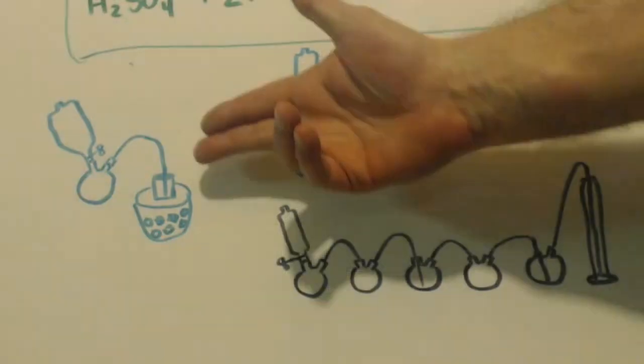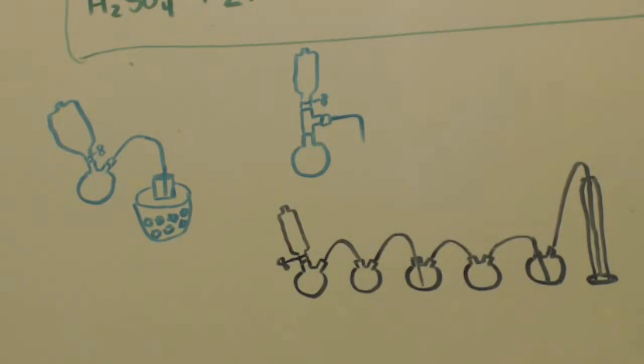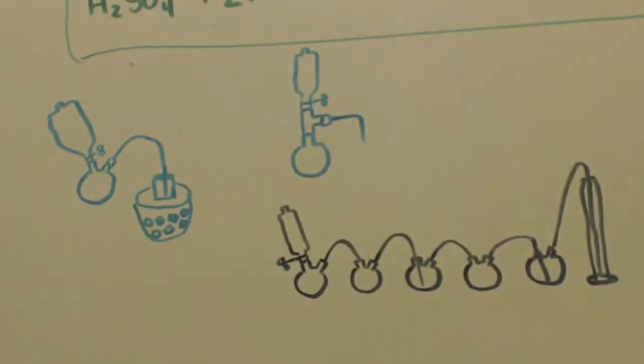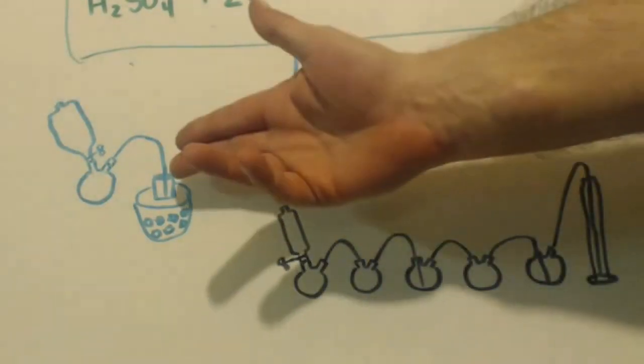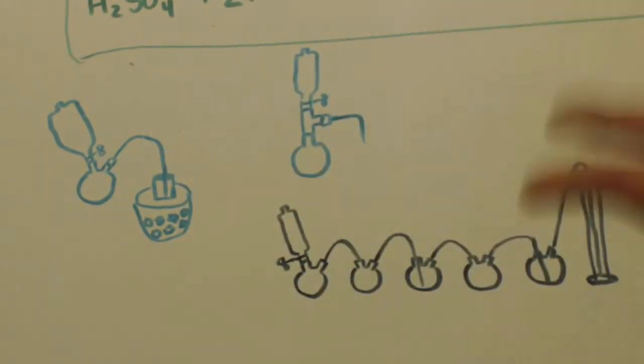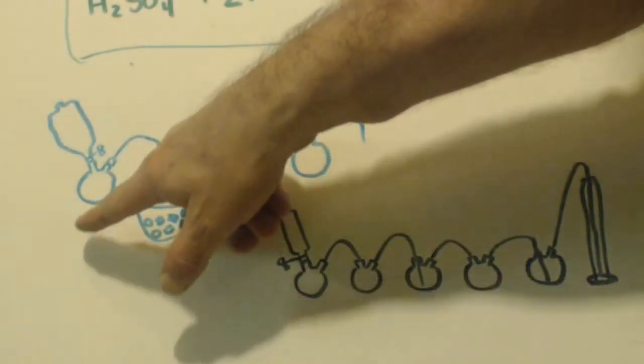Now for this setup, and I have done this many times like that, it's terrible, okay? If you don't have a fume hood, oh my. You're in and out of the room every couple seconds because you can't stand it. But that is the simplest setup. If you're doing it outside or somewhere where you can get downwind, this is great. If you're not experienced, you know what I mean?